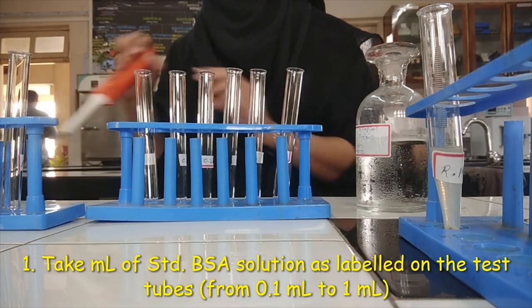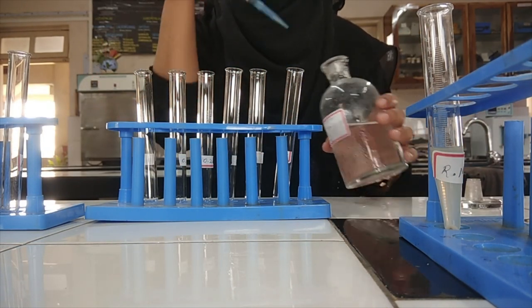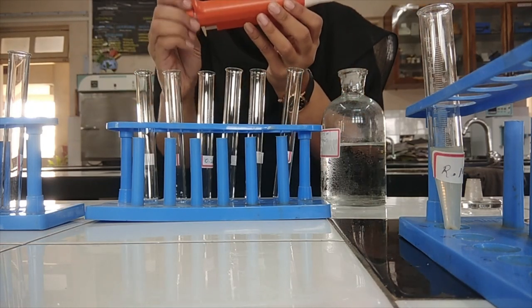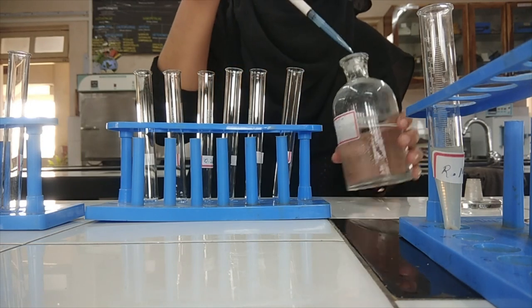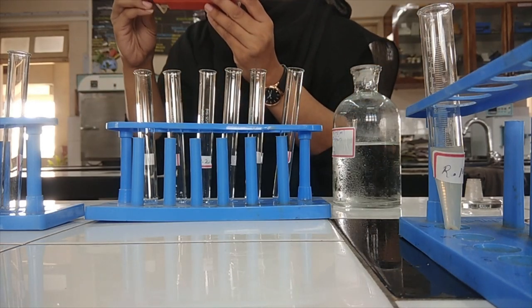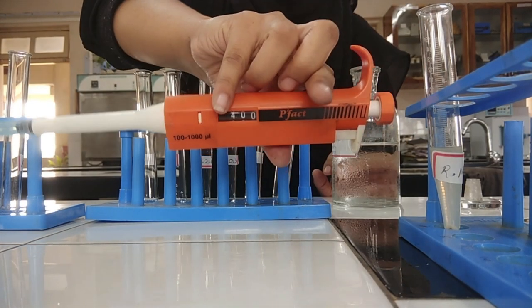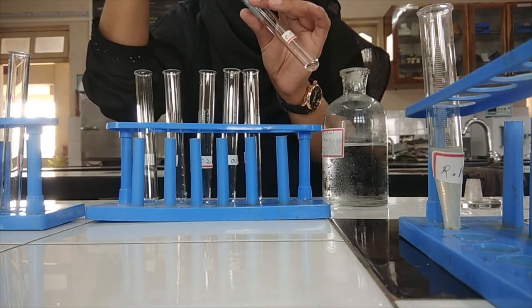First, to prepare setup for standard, measure 0.1 ml of standard BSA solution and pour it in the test tube labeled as 0.1. Here I am using a micro pipette, where 100 microlitres is equal to 0.1 ml. Go on increasing the volume of standard up to 1 ml. Remember, no standard protein solution to be added in the test tube of blank and reaction mixture.